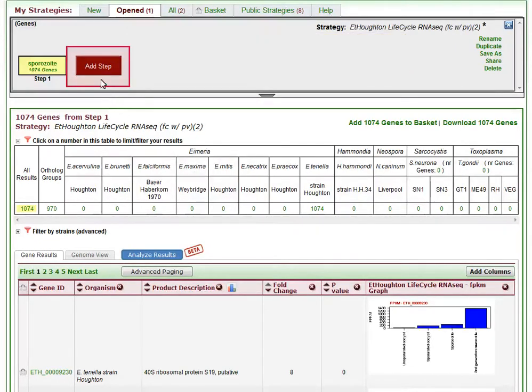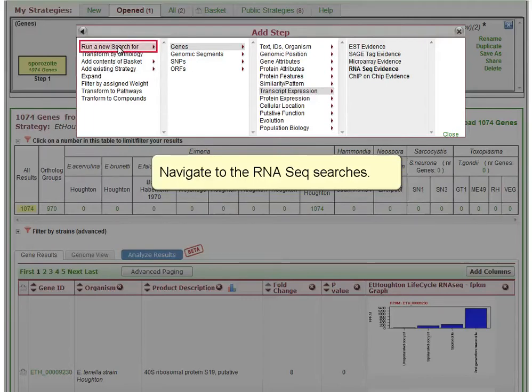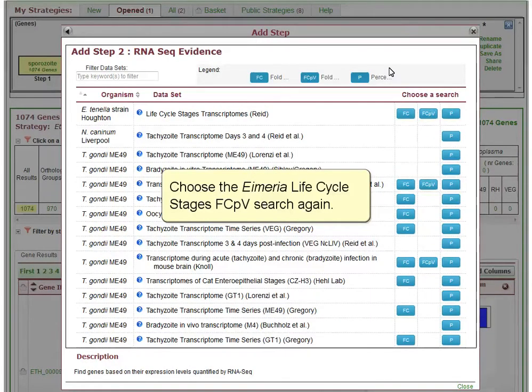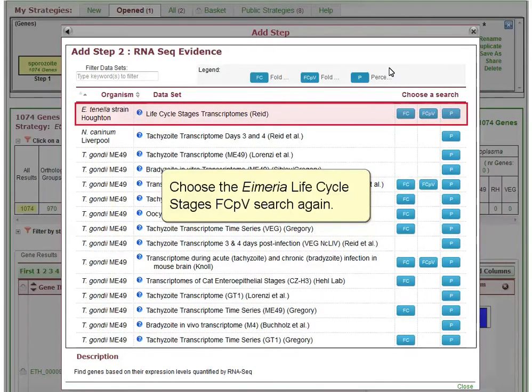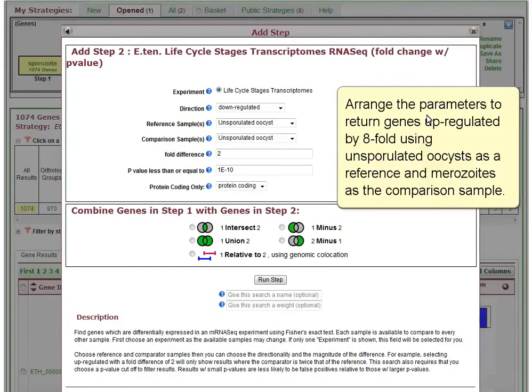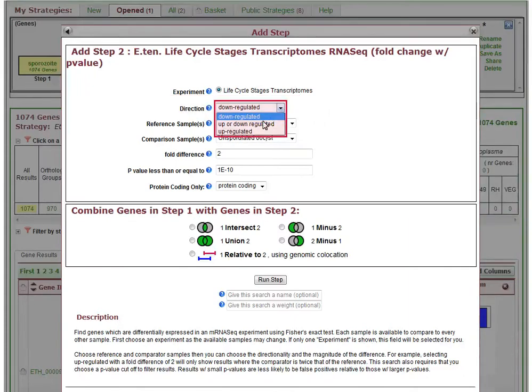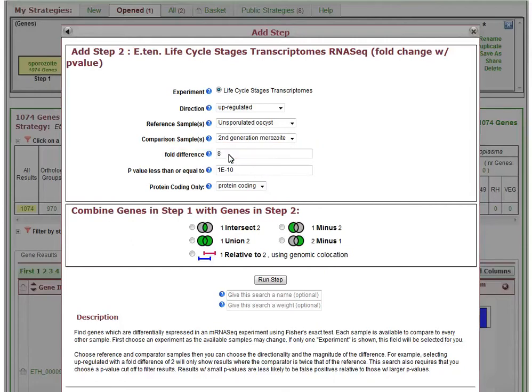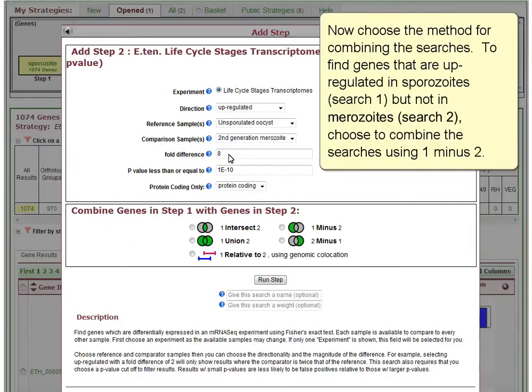Click Add Step to begin. Navigate to the RNA-seq searches and choose the Eimeria Life Cycle Stages FCPV search again. Arrange the parameters to return genes upregulated by eight-fold using unsporulated oocysts as the reference and merozoites as the comparison sample. Now choose the method for combining searches. To find genes that are upregulated in sporozoites but not in merozoites, choose to combine the searches using 1 minus 2.